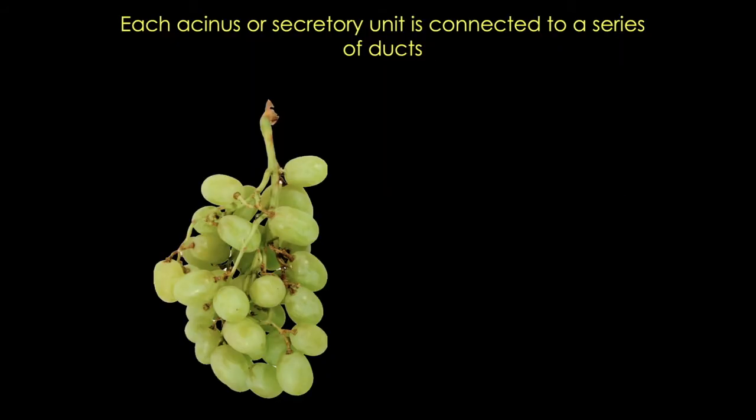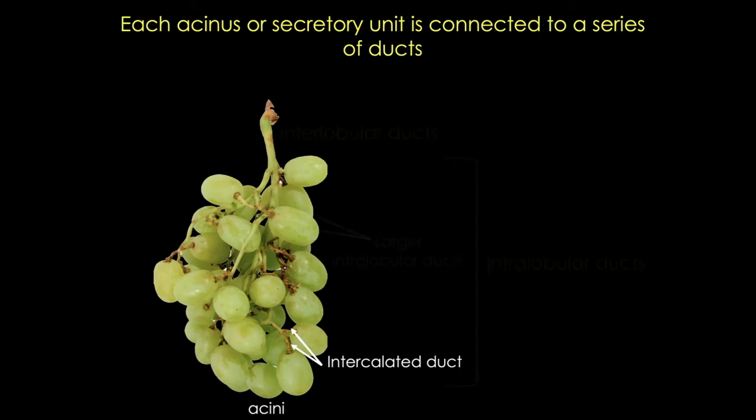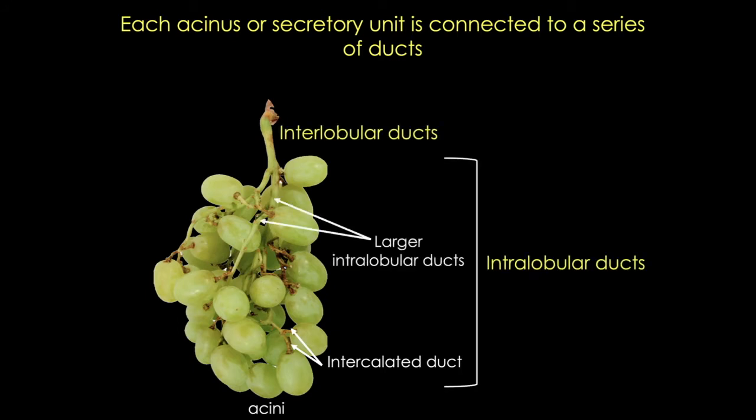They both contain secretory units called acini, which look a lot like grapes that are connected by a series of ducts. First we see the intercalated duct, which is like that stem coming out of an individual grape, and then there are a series of larger ducts.